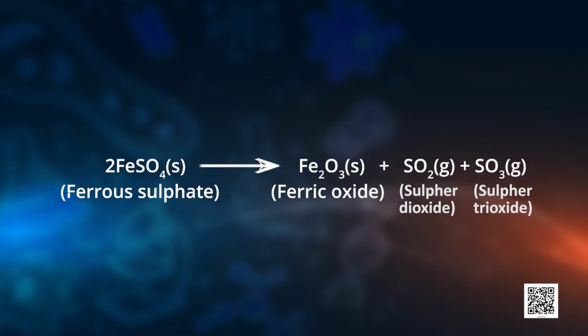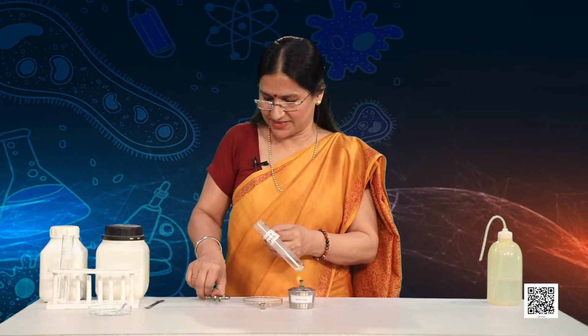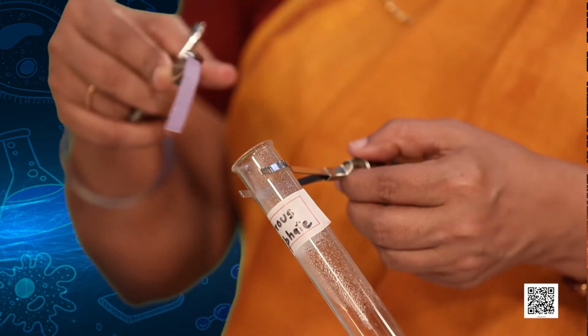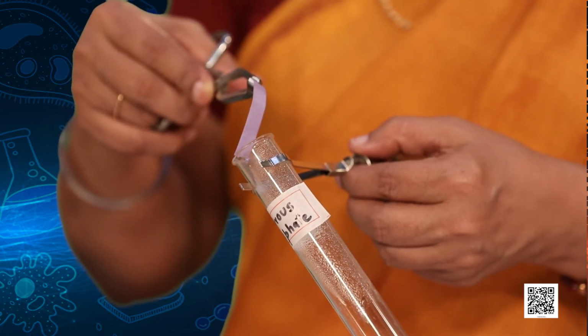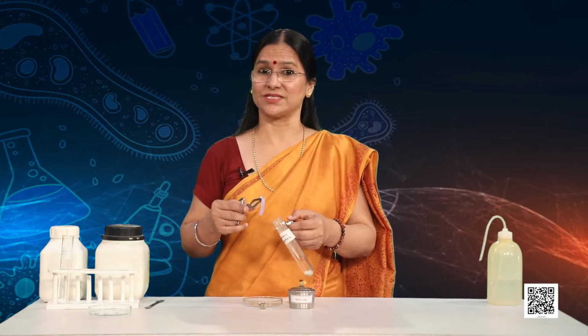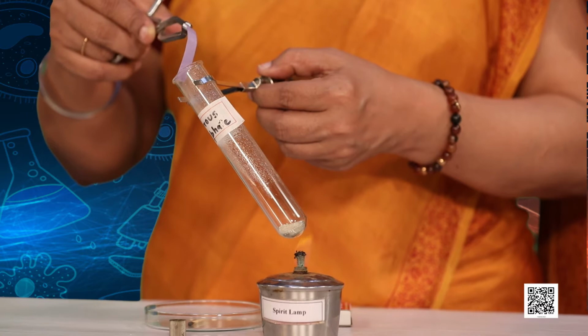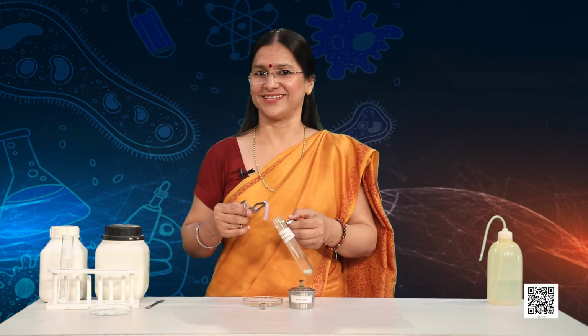Now friends, put on your thinking caps and tell me what will happen if I keep this moist litmus paper, the blue litmus paper, on the mouth of the boiling tube from where the gases are being emitted. You've already studied in your earlier classes about the change of the color of the litmus paper. So I'm sure you can tell me whether you will see any change in this blue litmus paper. And what would have happened if I had kept a moist red litmus paper? Think. If not, explore and find out.